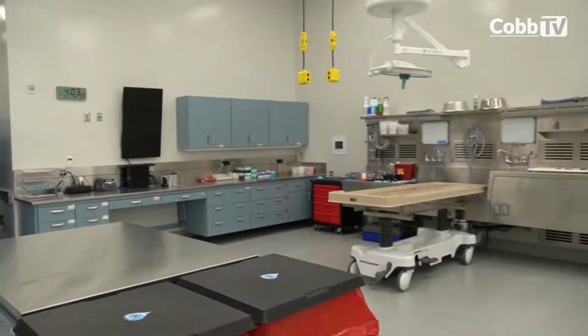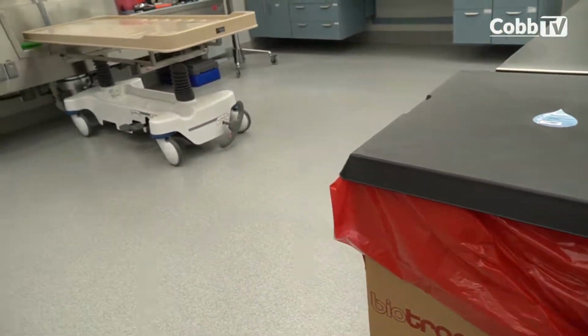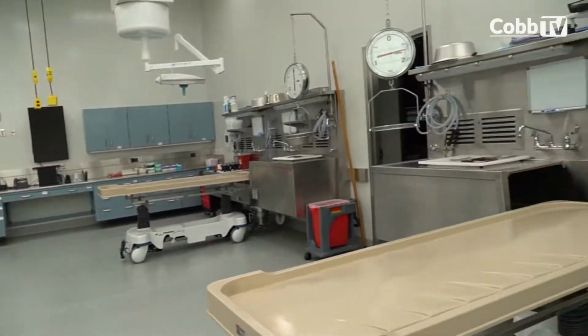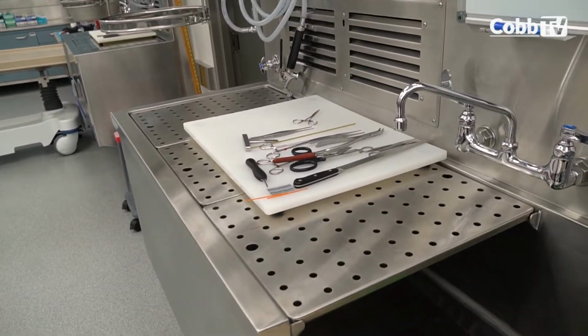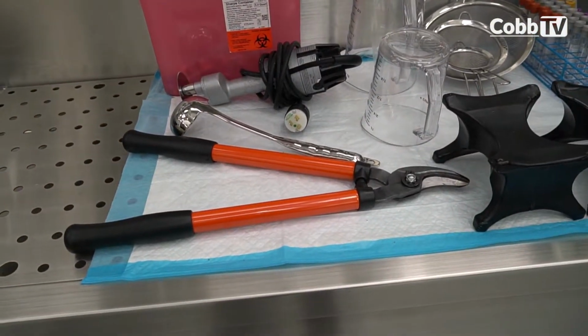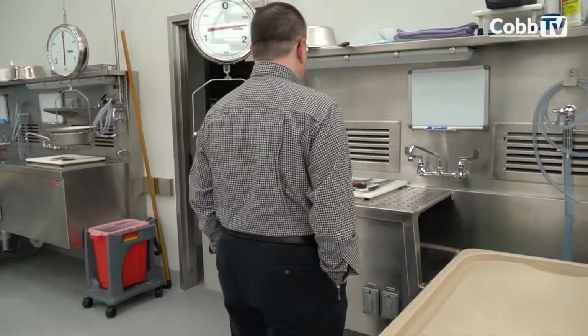We store all of our tissue and toxicology samples on site. However, our toxicology testing is done at an outside laboratory. Very few of our tools are particularly specialized. We do use a bone saw, which is similar to a cast saw, but otherwise we use scissors and knives and forceps, some of which would be at home in a kitchen, most of which would be at home in a surgical pathology or a hospital pathology room.